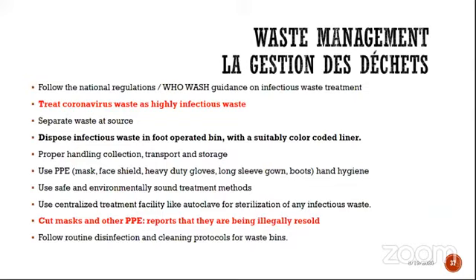Properly handle everything and transport it for incineration. For waste management, use proper PPE, which includes mask, face shield, gloves and so on. If you have waste of COVID-19 samples, you already wear PPE like Tyvek and so on.